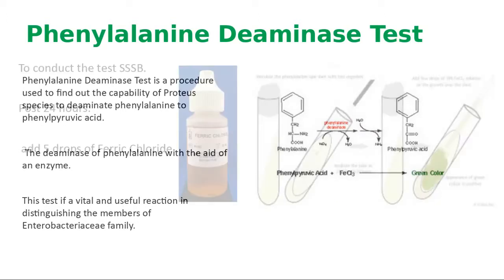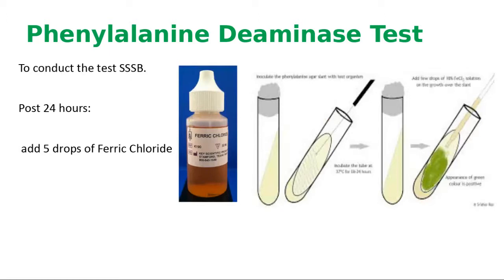Okay, so here you have it. So it's typically in a slant. And so tell me how you're going to inoculate the slant. What are you going to do to a slant?